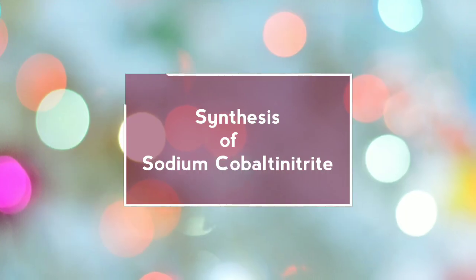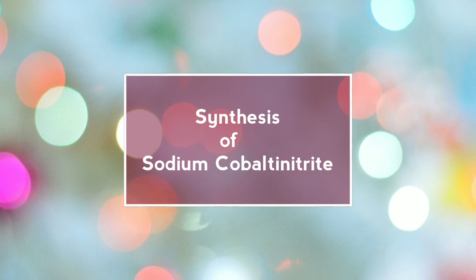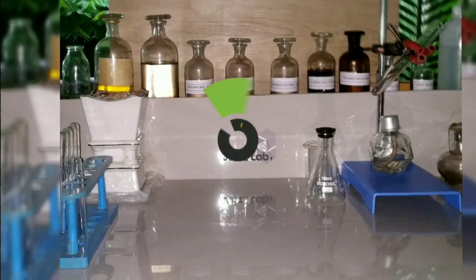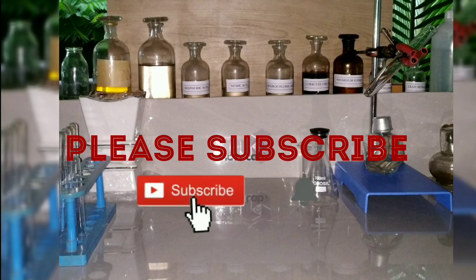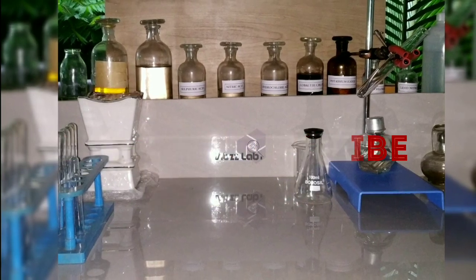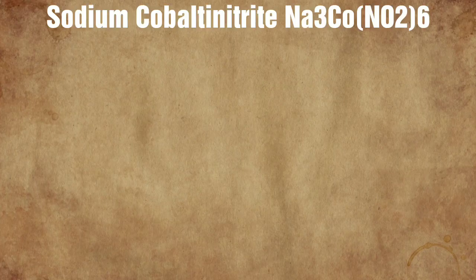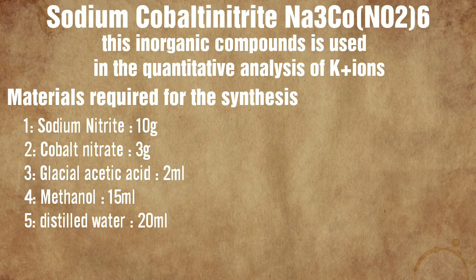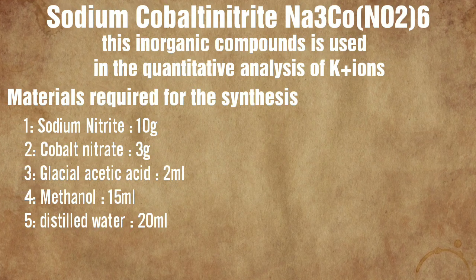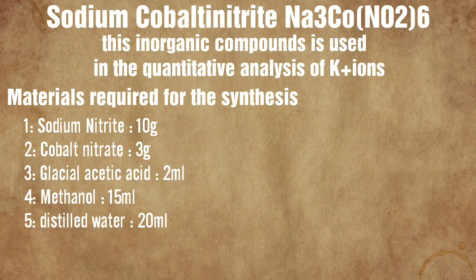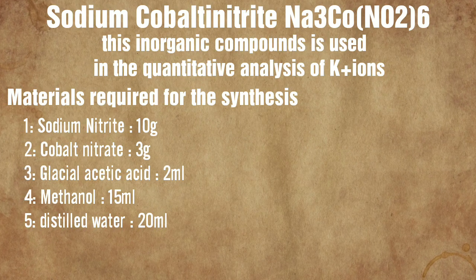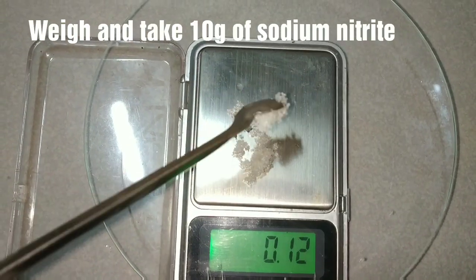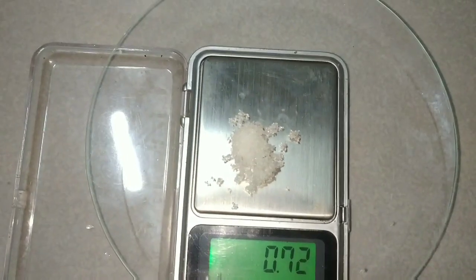Today we would be synthesizing sodium cobaltinitrite. Sodium cobaltinitrite is a very important coordination compound of cobalt used in the quantitative analysis of potassium ions. The first step of synthesis is to weigh and take 10 grams of sodium nitrite.